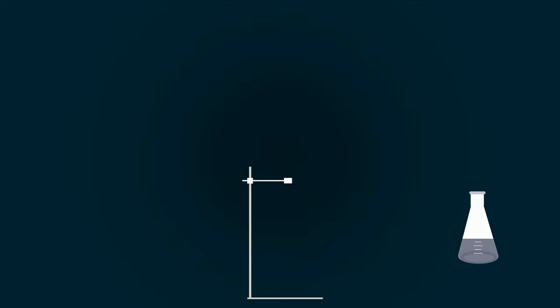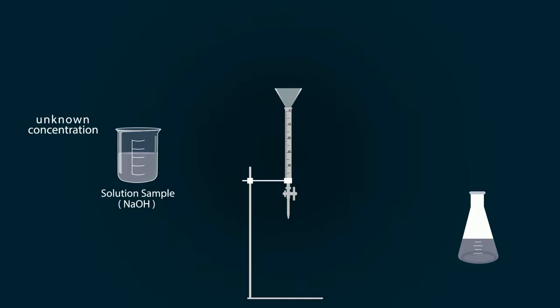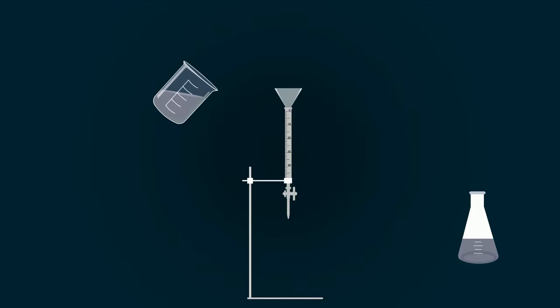Now take iron stand and put burette on it. Put funnel on the top of the burette. Now start adding NaOH sample solution with the help of a funnel into the burette. Fill the NaOH solution up to the zero point.